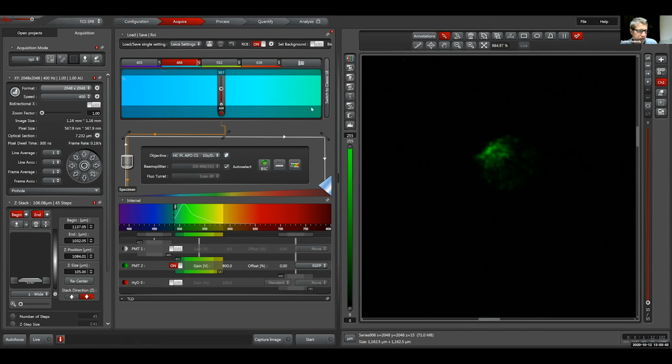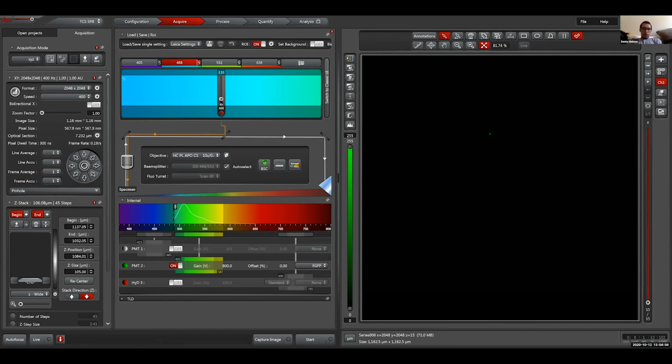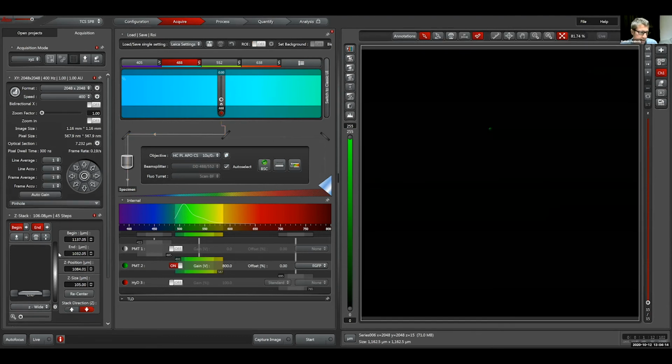I'm going to zoom out. Right now we're at 1000%. If I zoom out, does the whole thing... Oh, definitely turn this way back down. This should be at, where were we at? I think 4. Yeah, we were at 4, let's just compare it to 4. And turn off the ROI. And the Z-stack is more or less set.